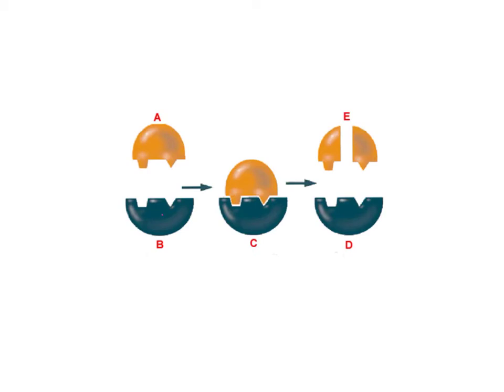For this lab, it's important for us to identify what's our enzyme and what's our substrate. Remembering that this is our enzyme as it remains unchanged from B to C to D, and this is our substrate as it gets broken up into products throughout the reaction. Our substrate, or reactants, in this lab is H2O2, hydrogen peroxide. Like mentioned in the background, this is a byproduct of metabolism and is present in the cells in our body right now.